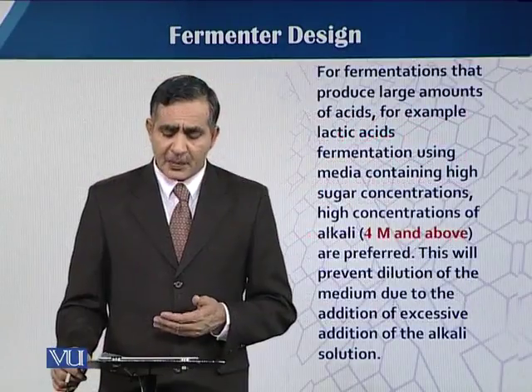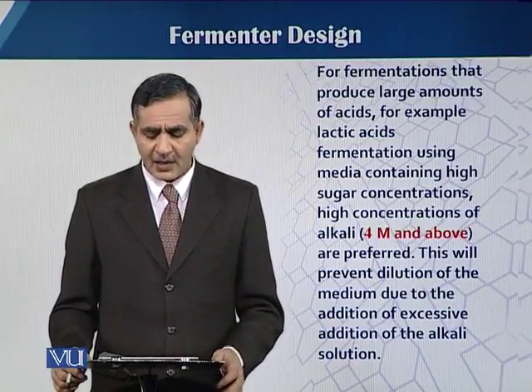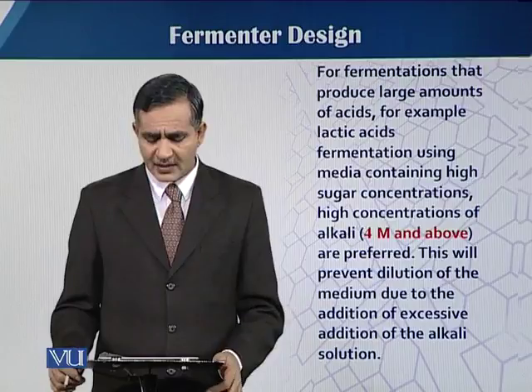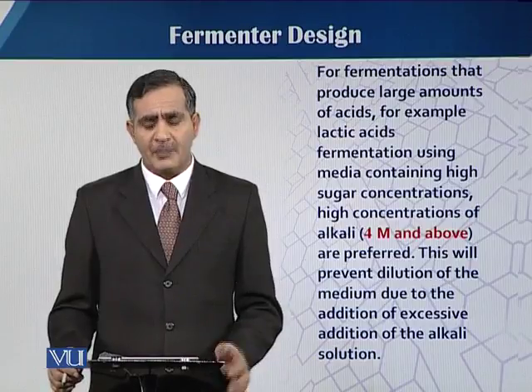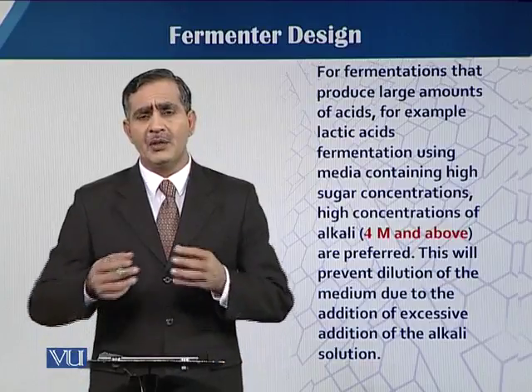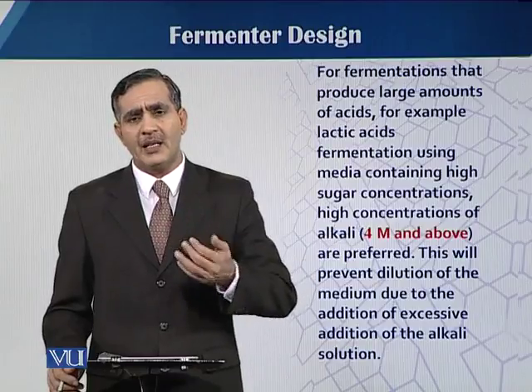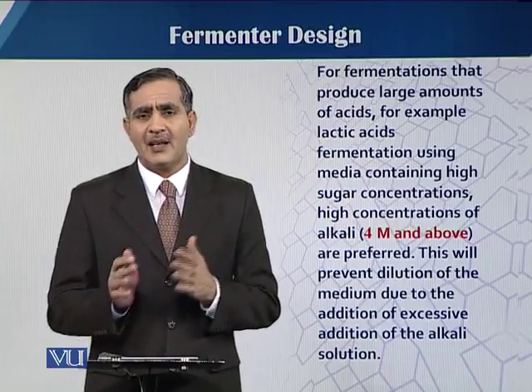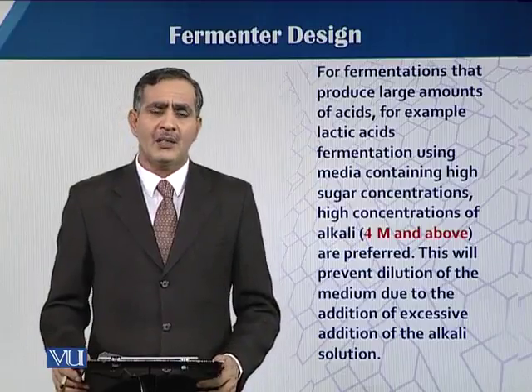For fermentations that produce a large amount of acids, for example lactic acid fermentation, some specific molarity is needed. So alkali of 4 molar and above is preferred. This will prevent dilution of the medium, because when we use a diluted neutralizing agent, that can raise the volume of the medium, which can affect the kinetic parameters. So we should use a specific strength and concentration of the acid or alkali agents which we use as a neutralizing agent.